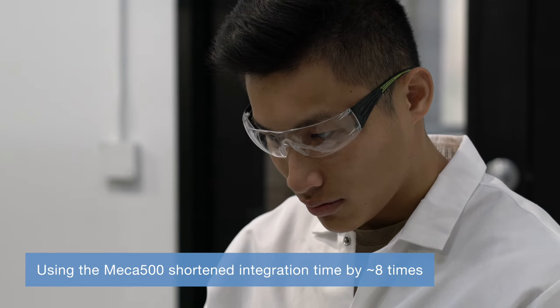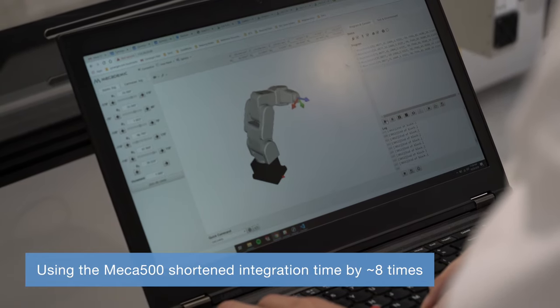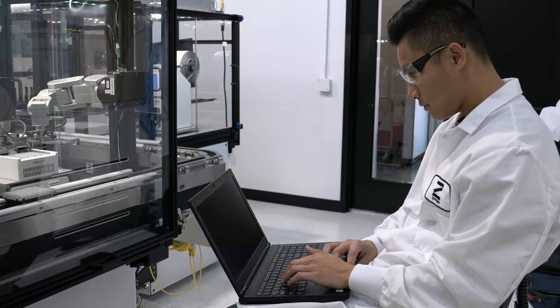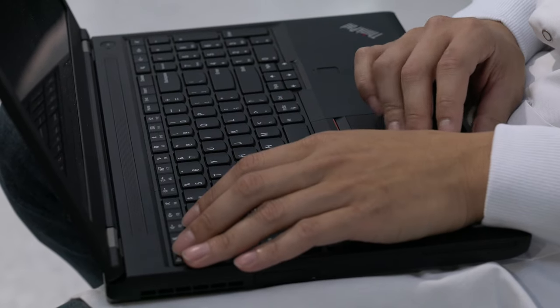We had a very good experience integrating the Mecca 500 robot. We effectively wrote software to control it in coordination with our other life science instruments within a month or two. By comparison, a lot of the custom robotics and robots we built ourselves took many more months, on the order of six to nine months, to arrive at something that was not nearly as good quality as what we had with the Mecca 500.